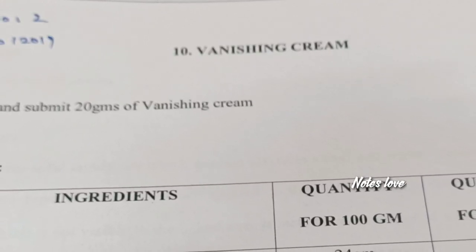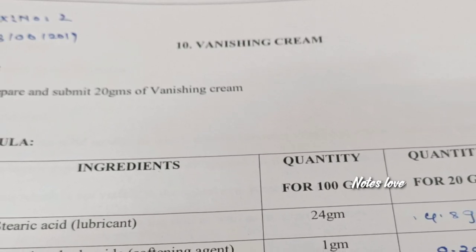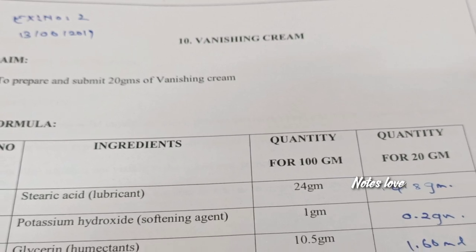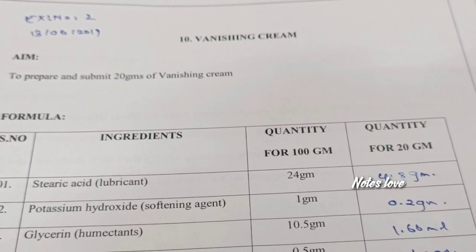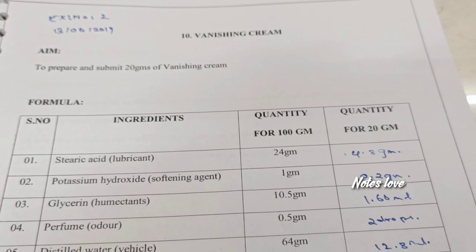Hi friends, in this video let me show you how to prepare vanish cream for 20 grams. We have a lot of ingredients like stearic acid and potassium hydroxide. We need to add stearic acid into the china dish and the other ingredients are added to the beaker. It's similar to a cold cream preparation.